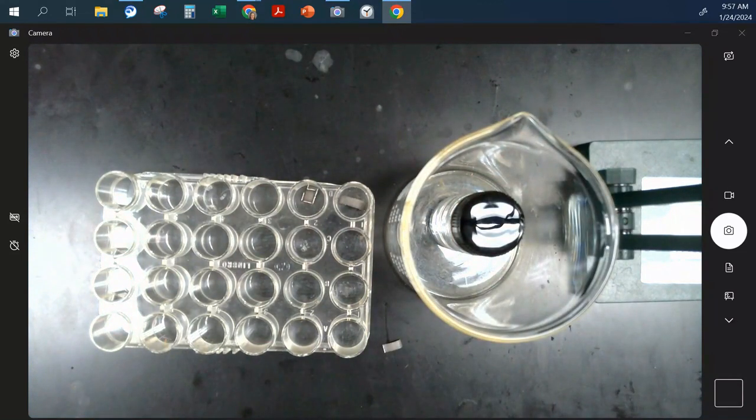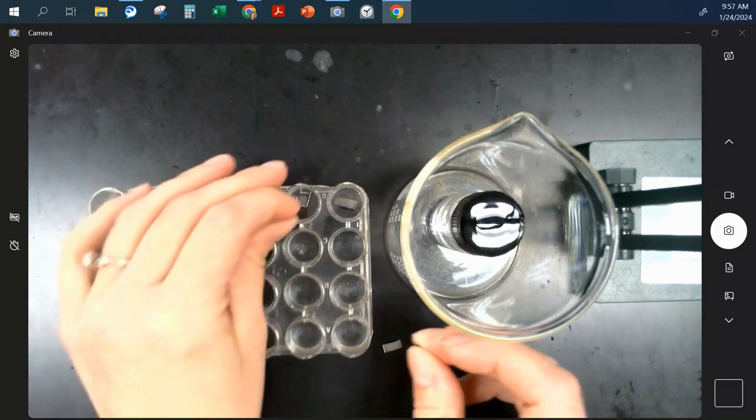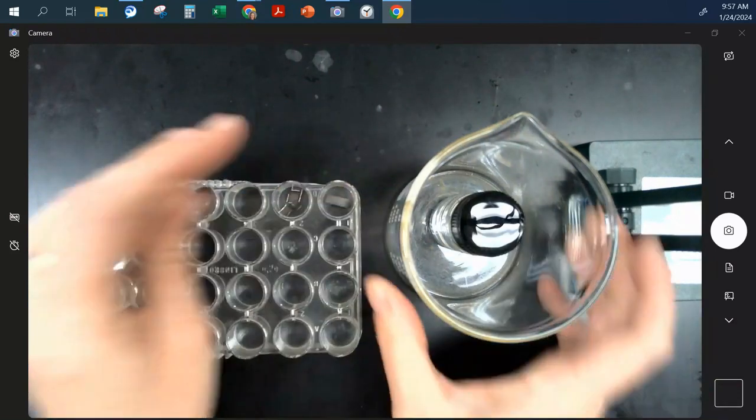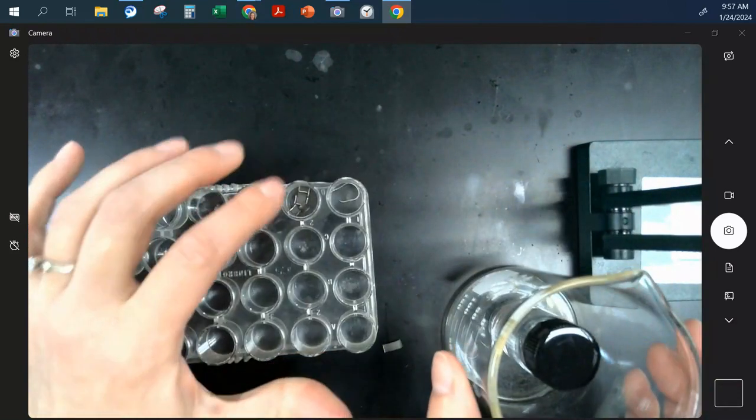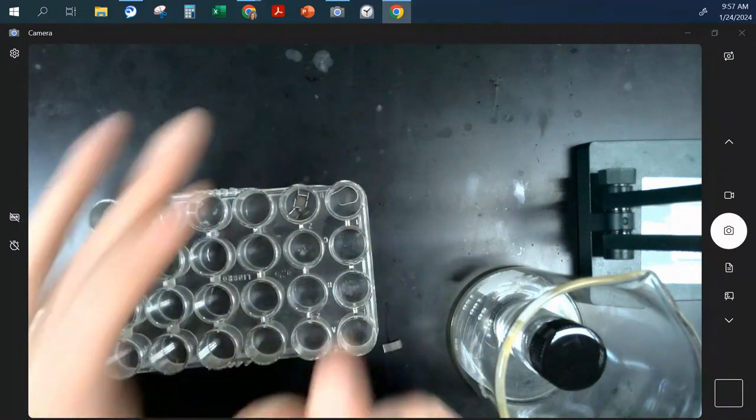Okay. You will have thermometers, but our question is, in general, what does the temperature do to the rate? You don't need to be super specific. Does that make sense? So if I heat it up, what happens? If I cool it down, what happens?